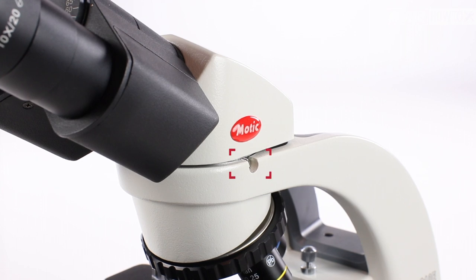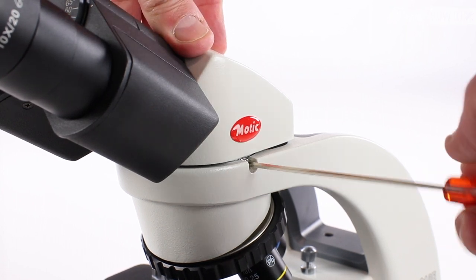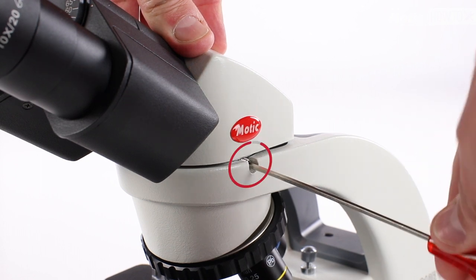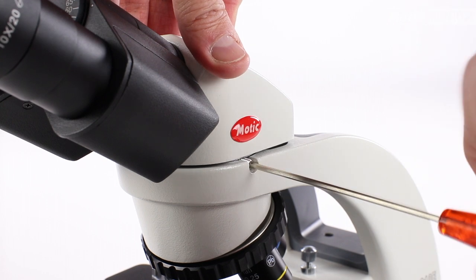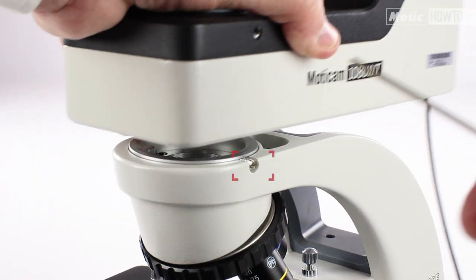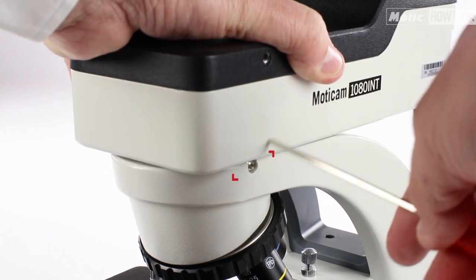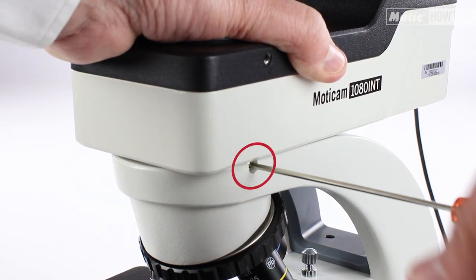First, the microscope head must be disassembled. To do this, we loosen the clamping screw with the Allen key and remove the head. Next, we place the bridge with the camera and the screen where the head was, and tighten the fixing screw with the Allen key.